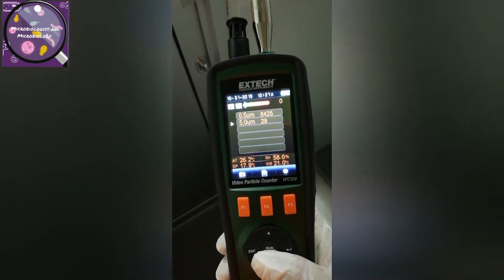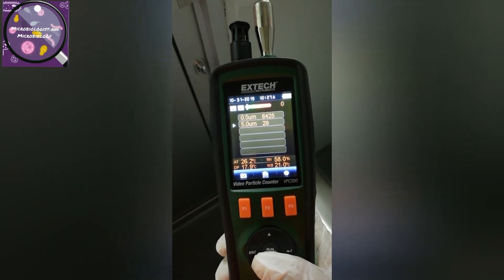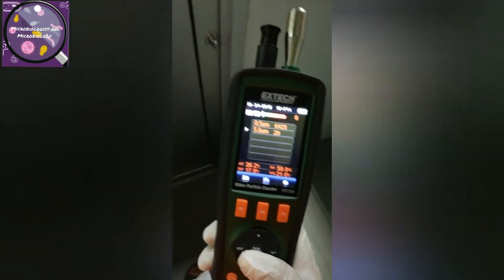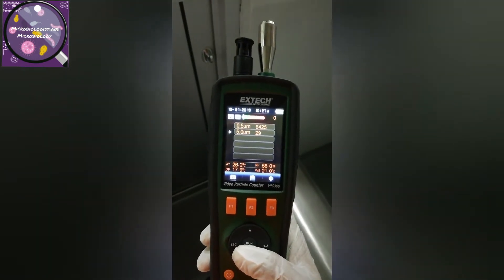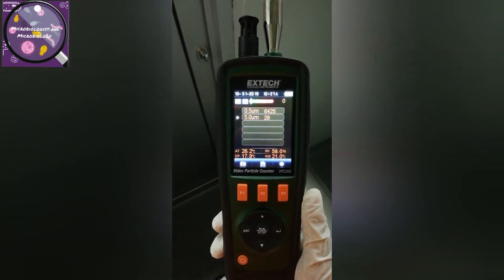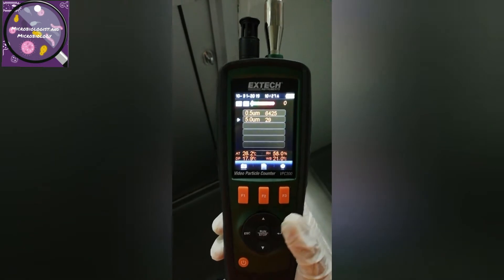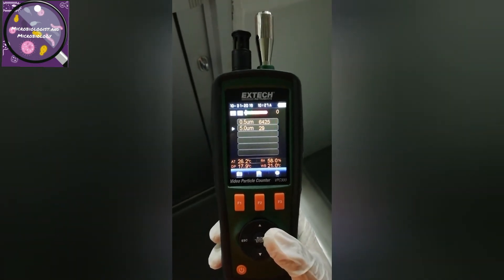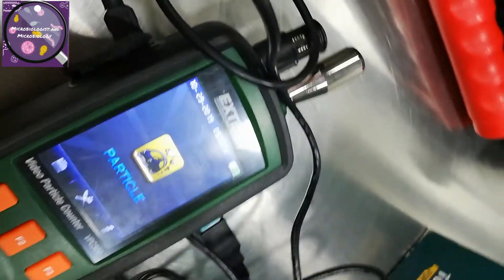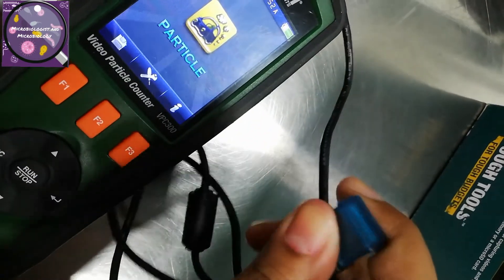The results are in my hands now, but I will calculate these results with a correction factor, because this particle counter is basically 0.1 CFM, which is not the requirement as per our limit. I will calculate it with the factor and share the calculation in my video when I share the SOPs — and I will definitely share the particle counter SOP as well.